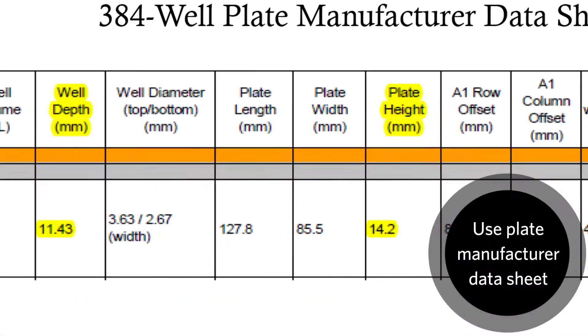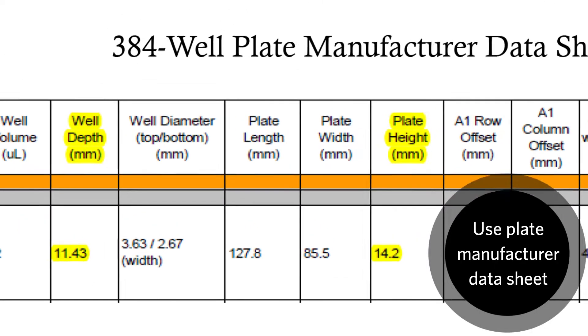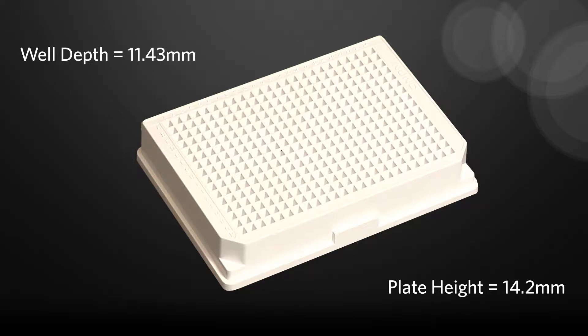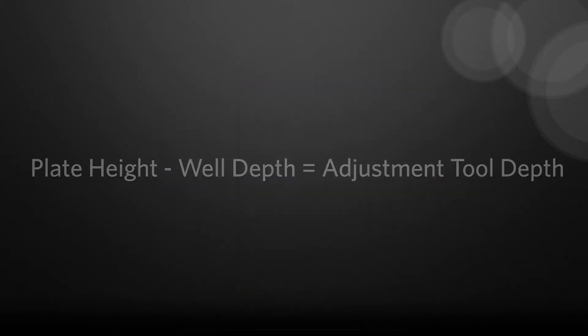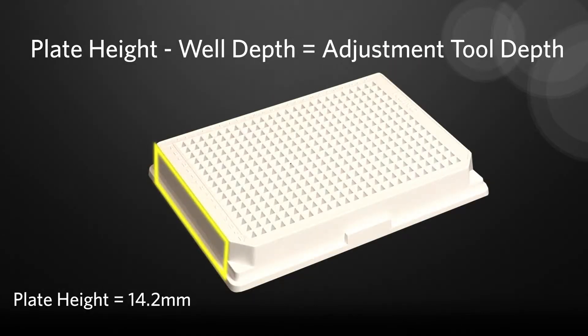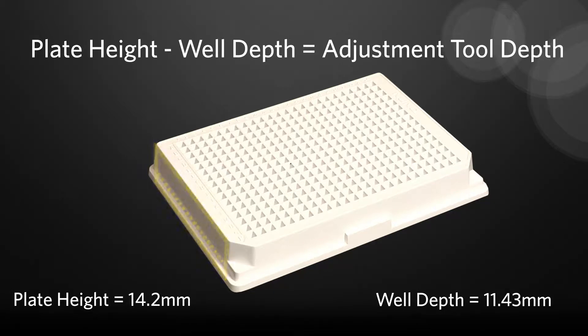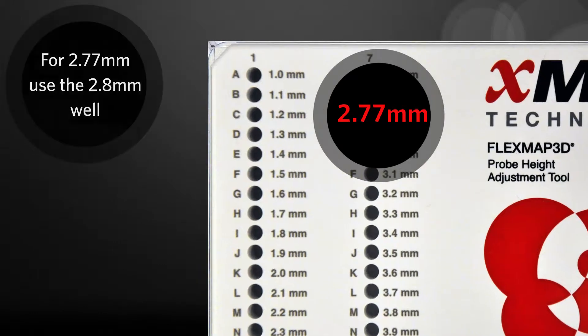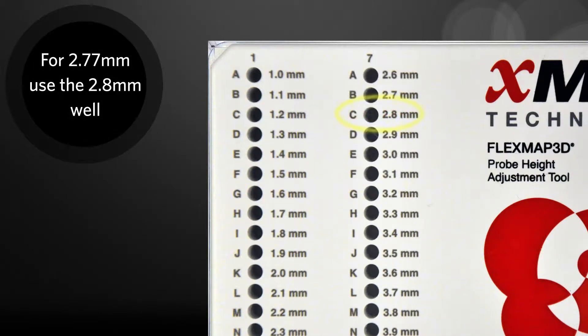This will require obtaining the well depth and plate height from the data sheet provided by the plate manufacturer for the plate you intend to calibrate the probe to. Subtract the well depth from the plate height. For example, if the plate height is 14.2mm and the well depth is 11.43mm, subtracting the well depth from the plate height gives us 2.77mm. So this means you have to use the 2.8mm plate height adjustment well.